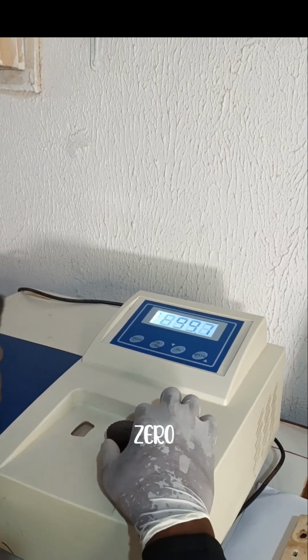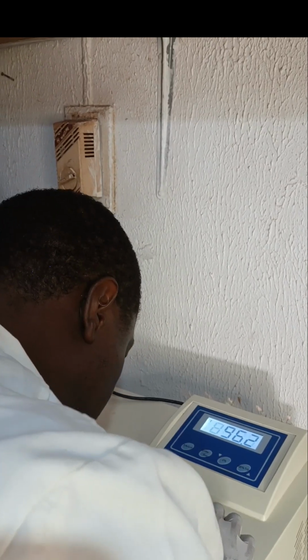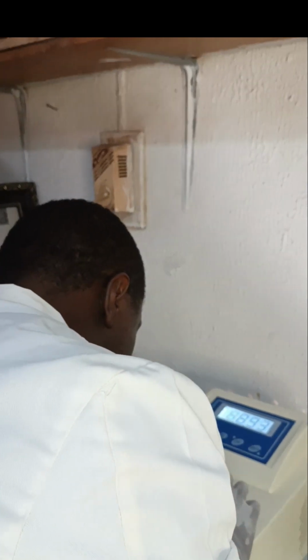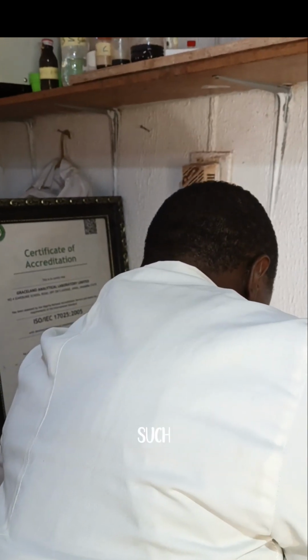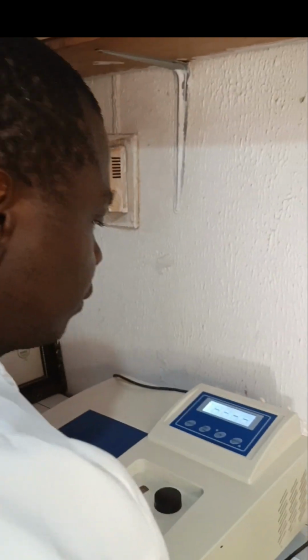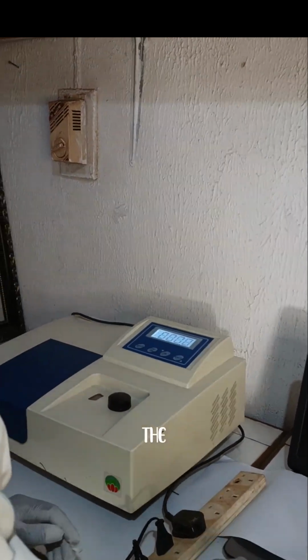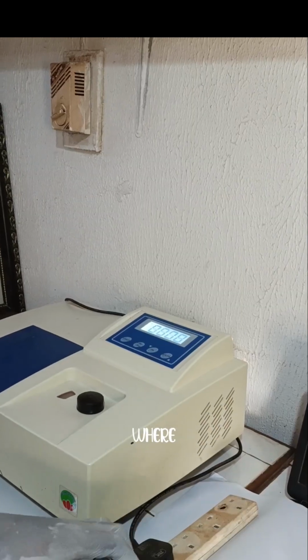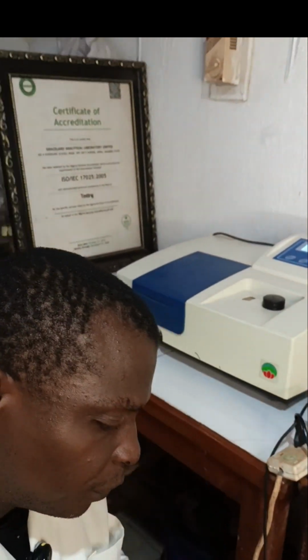As we've brought it to zero, the next thing we'll do is to search through the wavelengths so that we can get the best wavelength where we will perform this analysis.